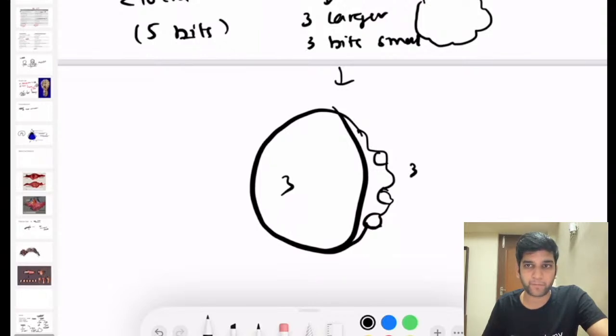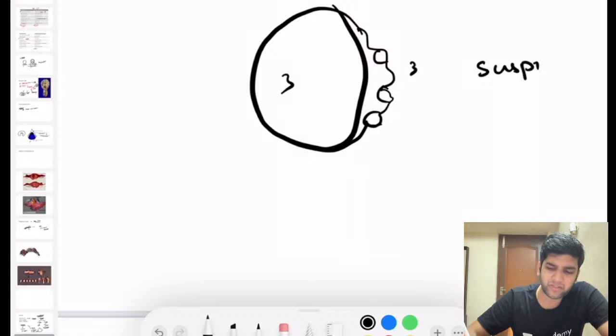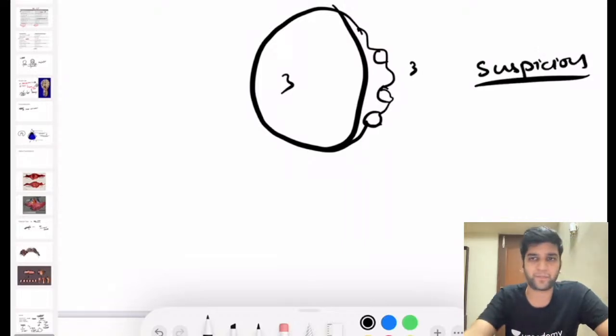Fine. Okay. Just a question for you. How will you pick up necrosis in gross of a myoma? Because you need to pick up necrosis in a gross of a myoma. If you're not able to pick up necrosis, you will not be able to properly sample, right? How will you pick up necrosis in a gross of a myoma? Or what all changes in gross is suspicious? I'm not just saying it's necrosis, just suspicious change. Anything which you feel grossly will be suspicious.